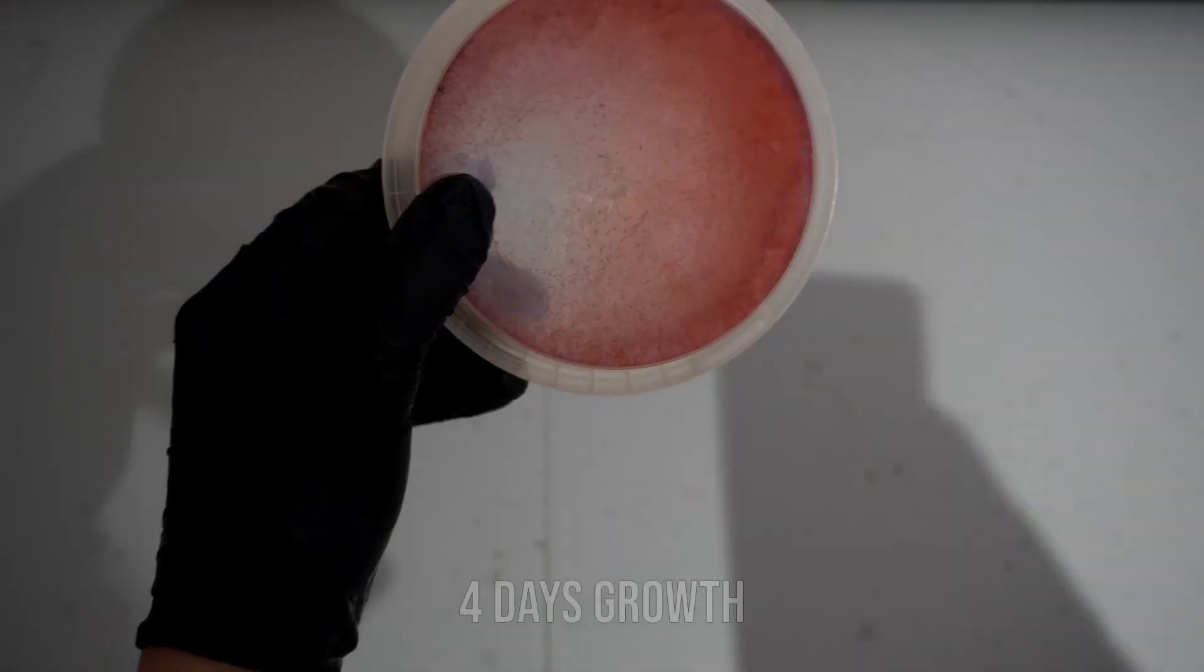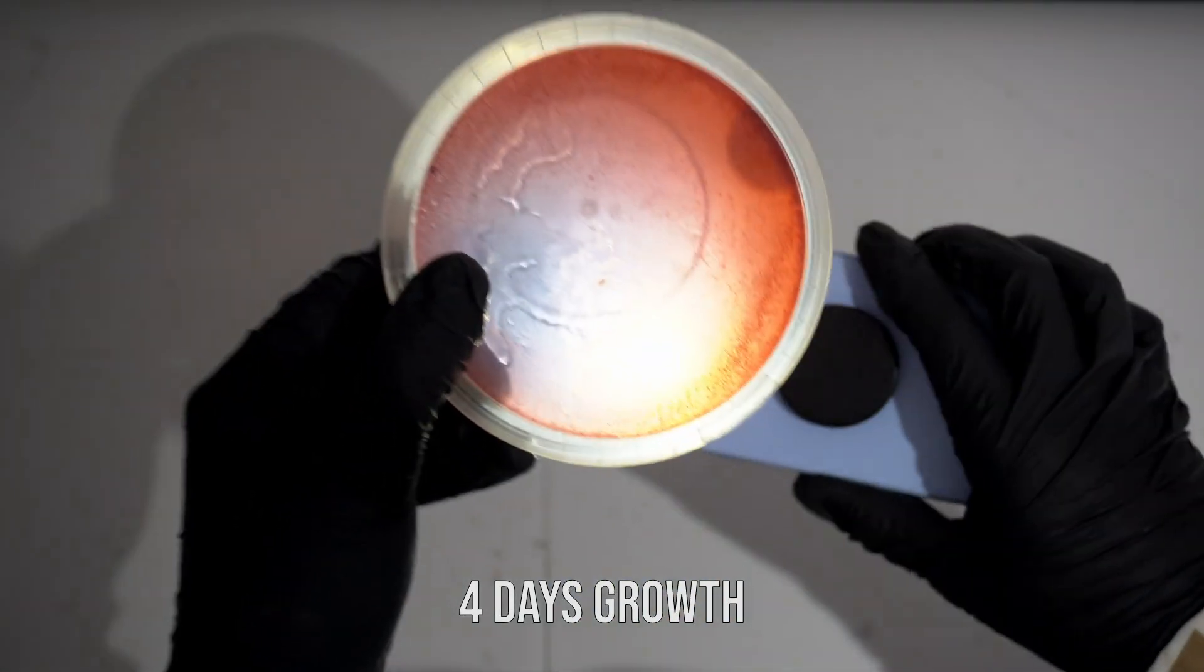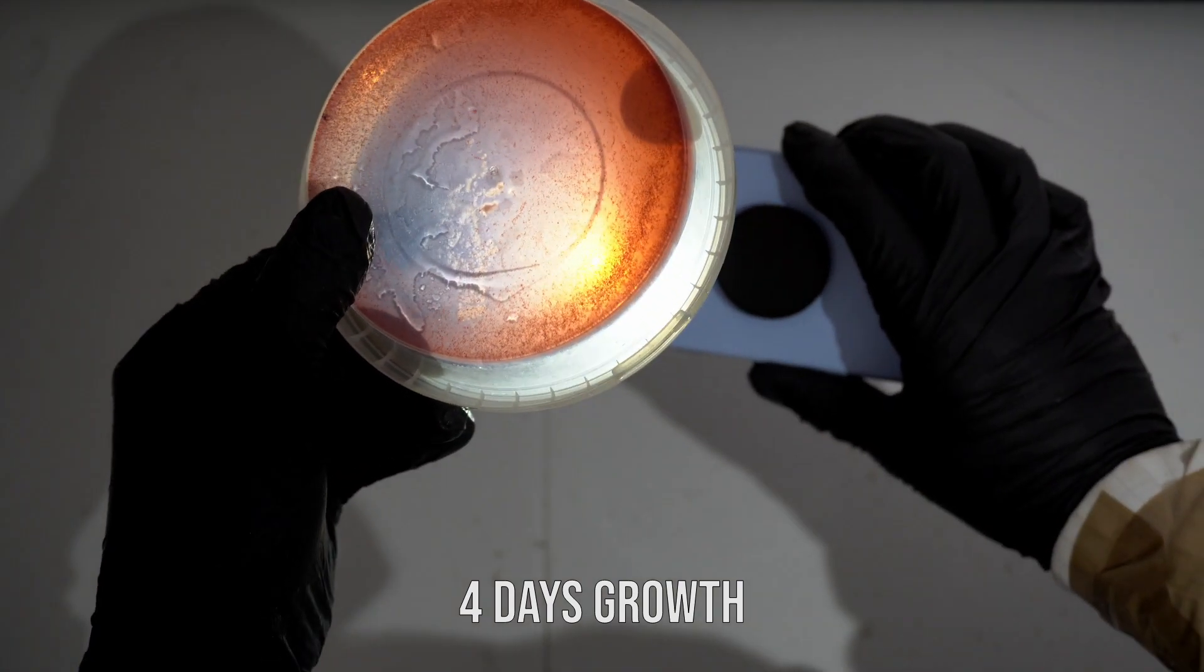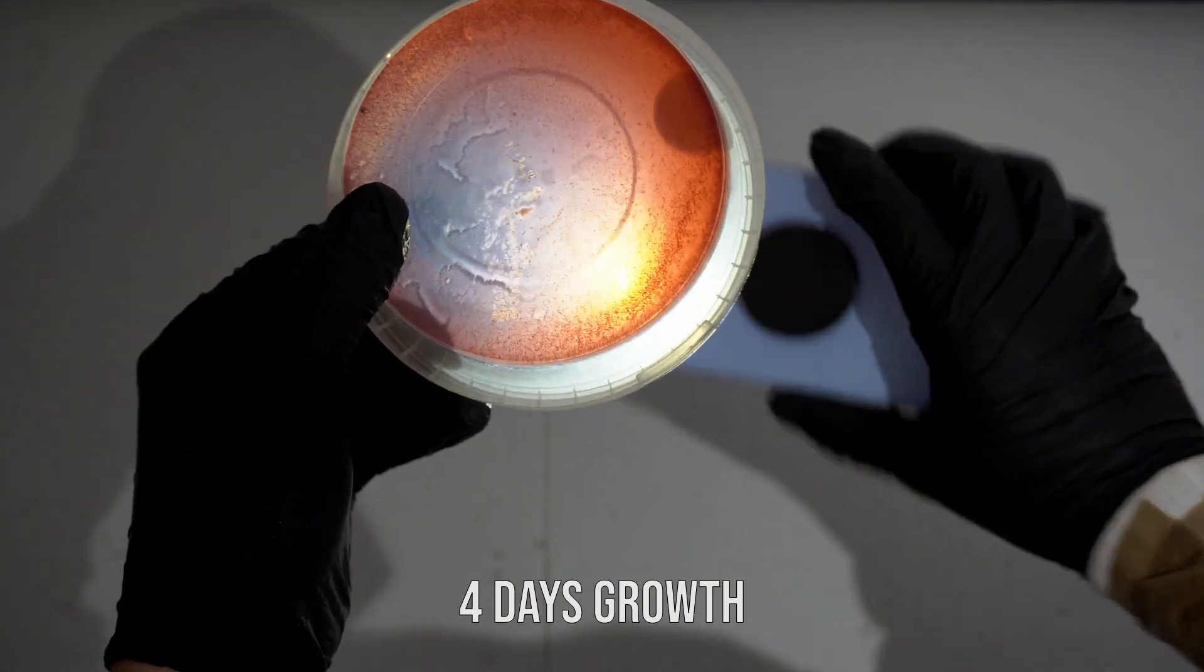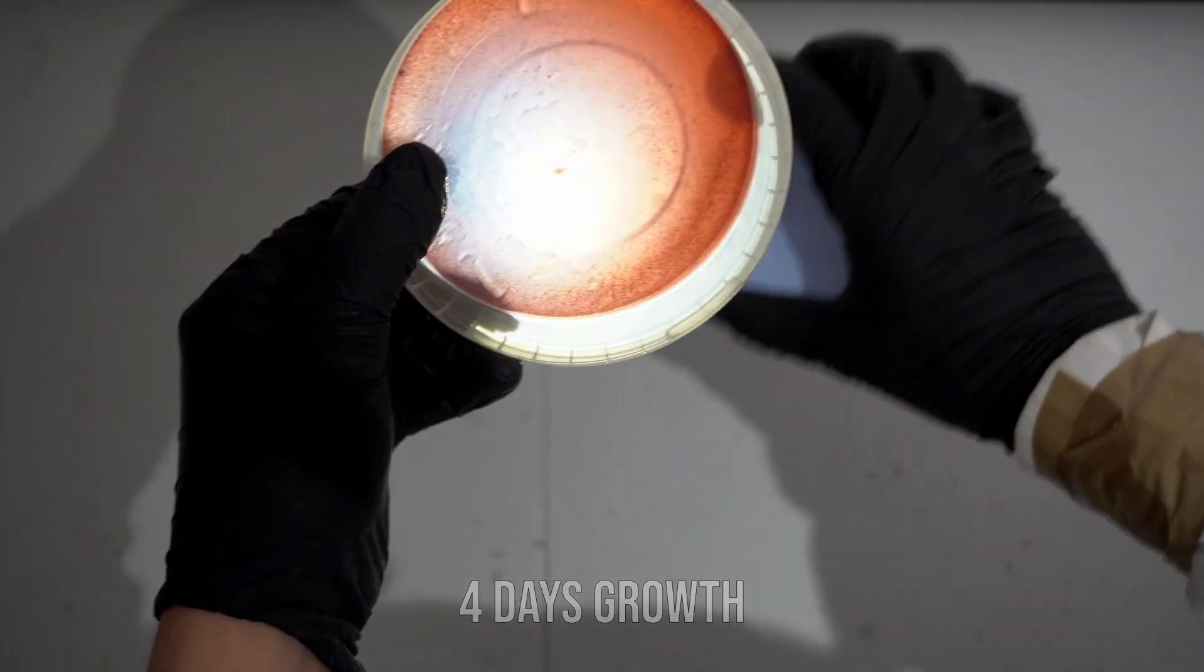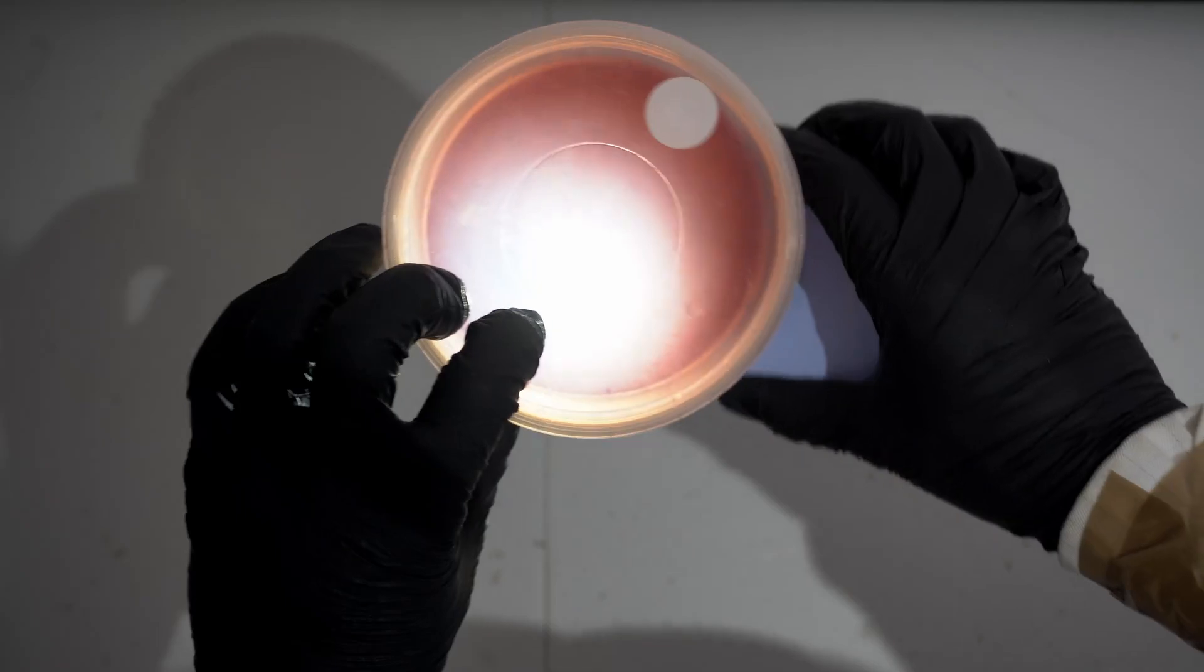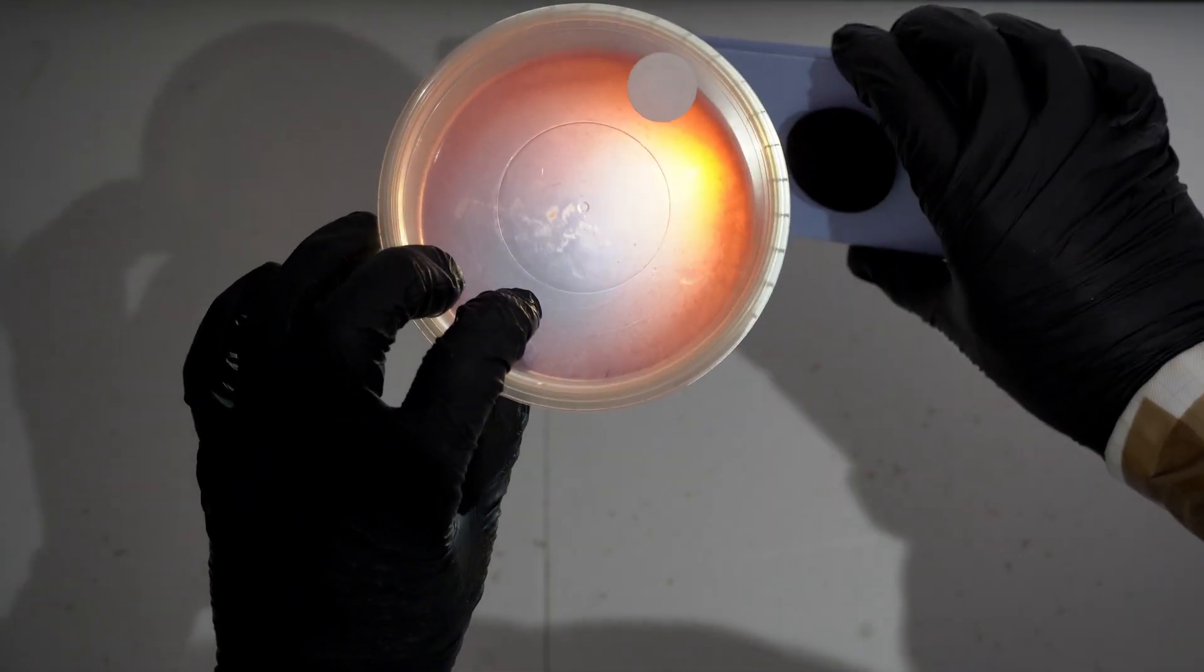What you see here is four days growth from inoculation and you can see there's a very defined line where we went into the agar and then out. That's where all the spores have either dropped or where we tapped it in the center. So instead of having it all over the plate, we can see the defined line where we made the inoculation.